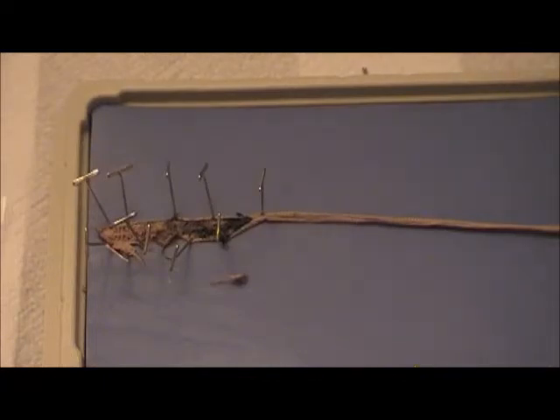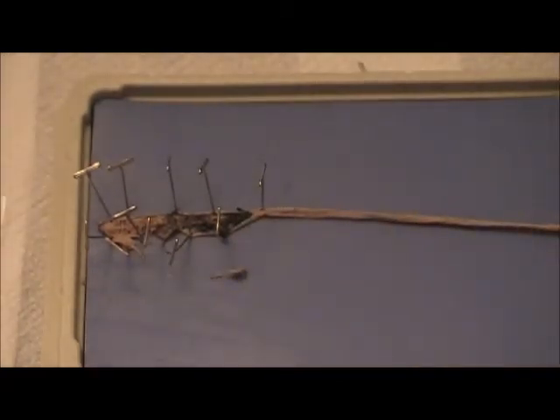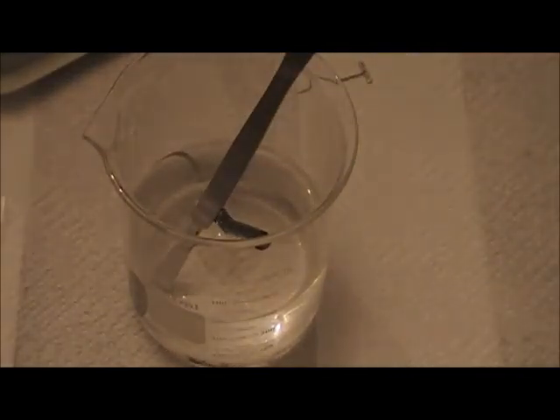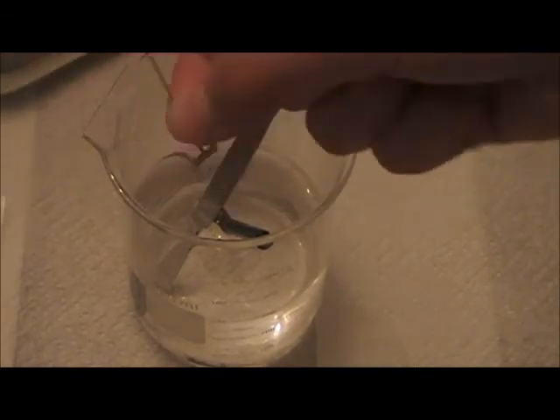And before we go, let me just say you have to sterilize everything once you're done. So I'm going to get some hydrogen peroxide. I'm not sure exactly how it will work out, but here's some hydrogen peroxide. Put your tools in there, and obviously they'll be clean, but we'll see how that goes. Also make sure you put your T-pins in there. Don't forget about those.